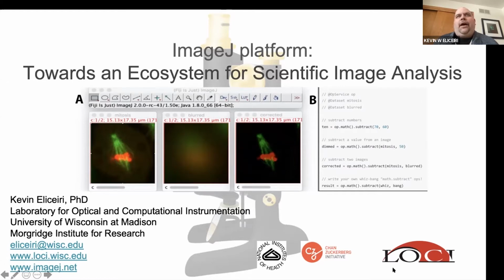So I'll talk a bit about how we recognize there are so many wonderful tools. At last count, 60-plus great open source tools in this microscopy analysis world. And they all have merit. And we recognize that we want to create more of an ecosystem. So I'm going to talk about what we're trying to do to create a community and how this ImageJ-driven community may be relevant even if you don't use ImageJ. And if you do use ImageJ, things we're trying to do to make ImageJ more relevant to you.